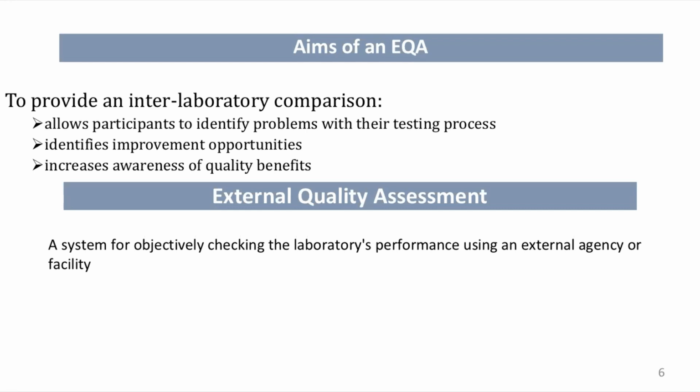When you are participating in EQAS and you get information that your results are not comparable with your peer group, with the other laboratories following the same EQAS, then you look into it. First you identify the problem, then you carry out root cause analysis and find out the reason and how we can improve this.